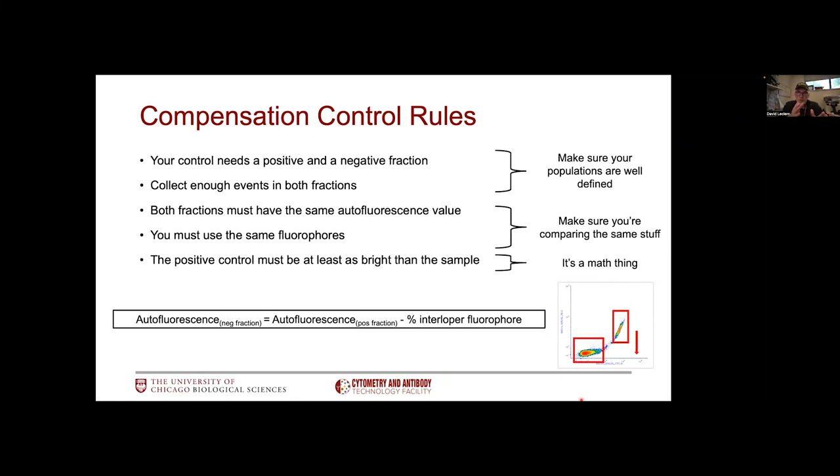The last rule says that the positive control must be as bright or brighter than what you'll find in your sample. This is simply a math thing. You want to have a control which is as bright as possible so you can positively figure out what's going to happen with a dimmer signal that you'll find in your sample. If the reverse is true and your control is dimmer than what you'll find in your sample, you end up extrapolating. You might get lucky and be correct, but that's unlikely, and you're going to be stuck with a compensation matrix that simply will not work. When you extrapolate, you made extra of Paul and Nate.